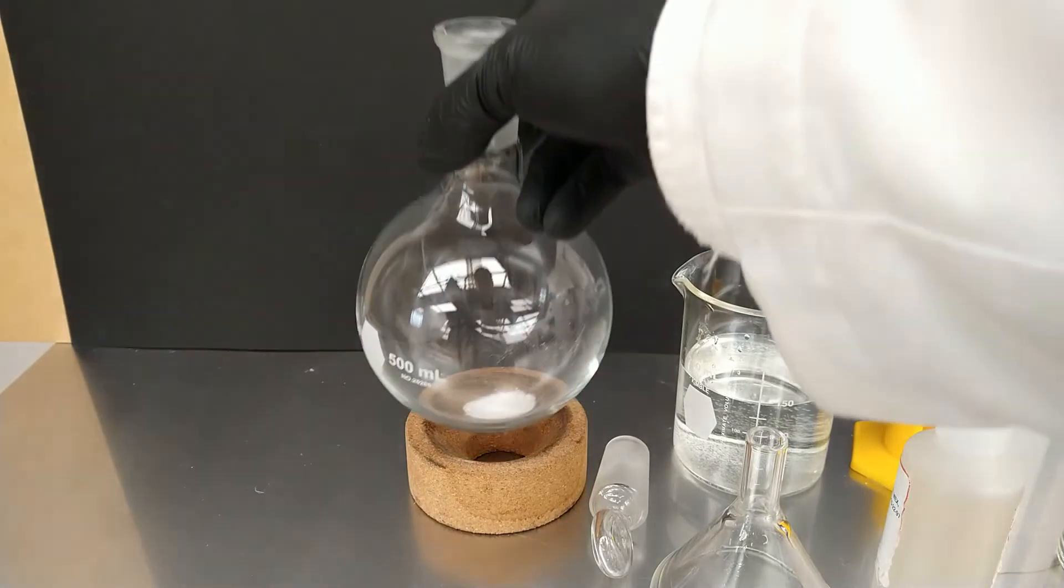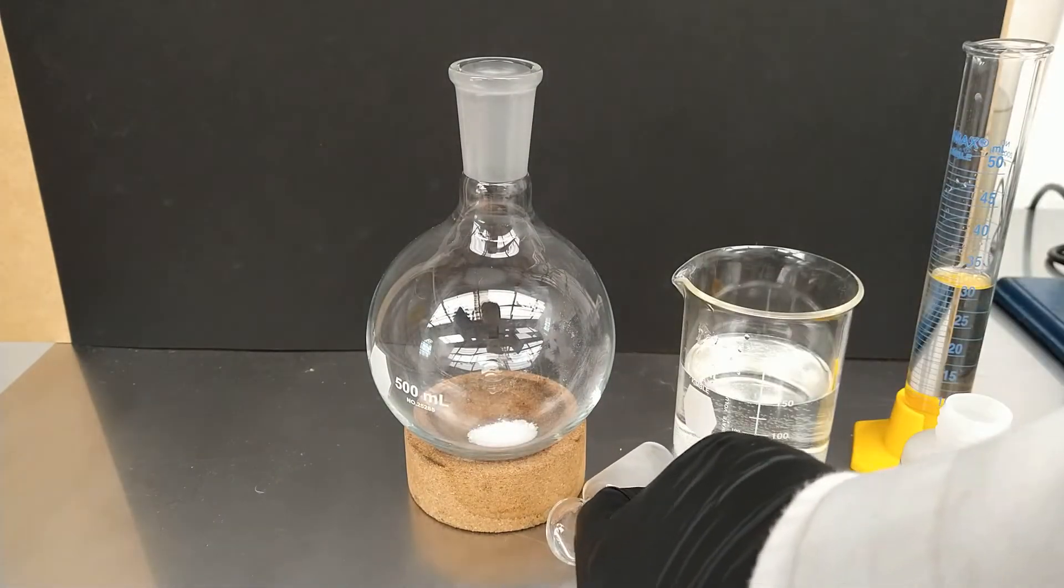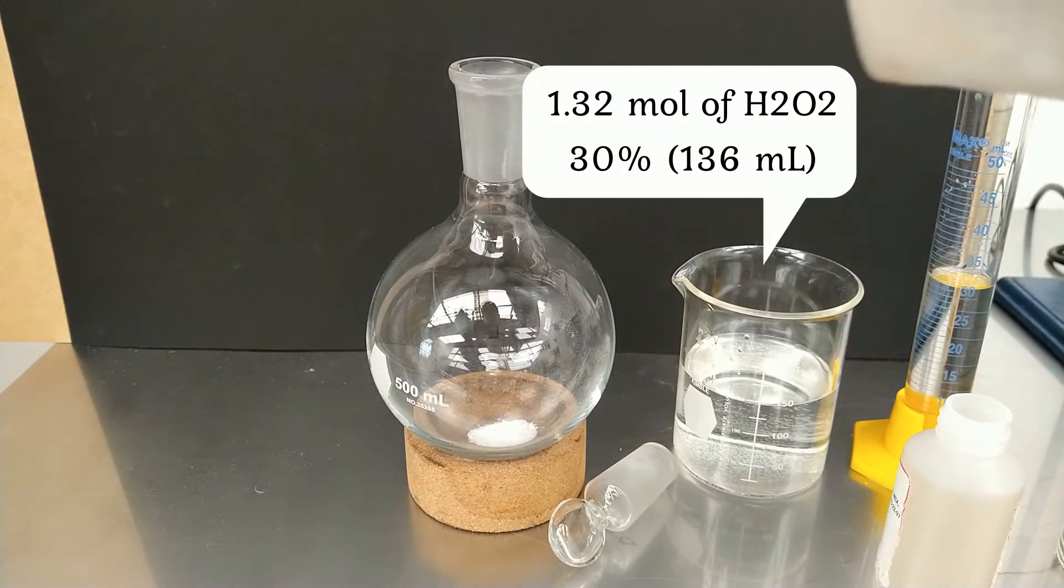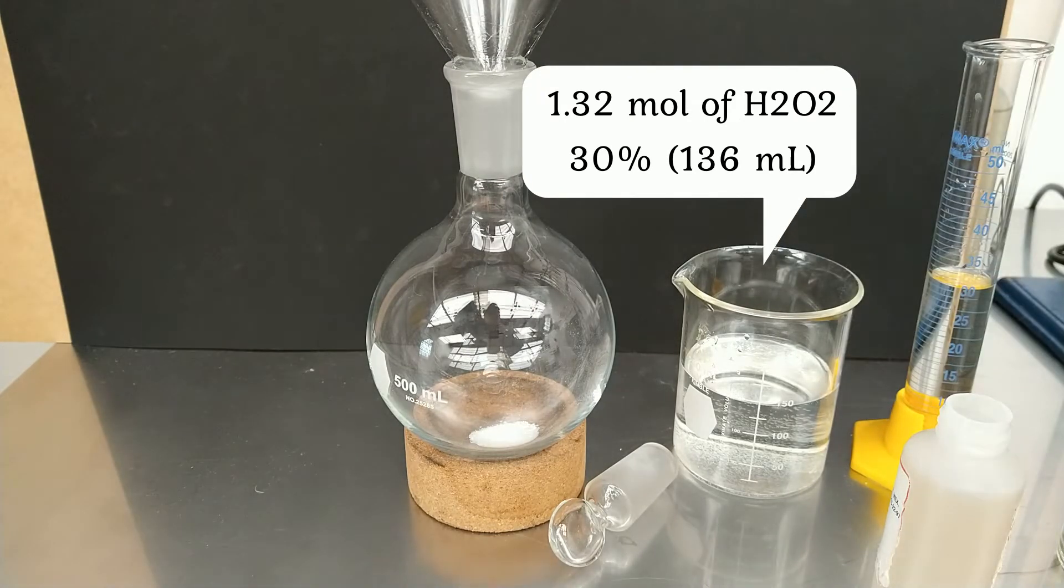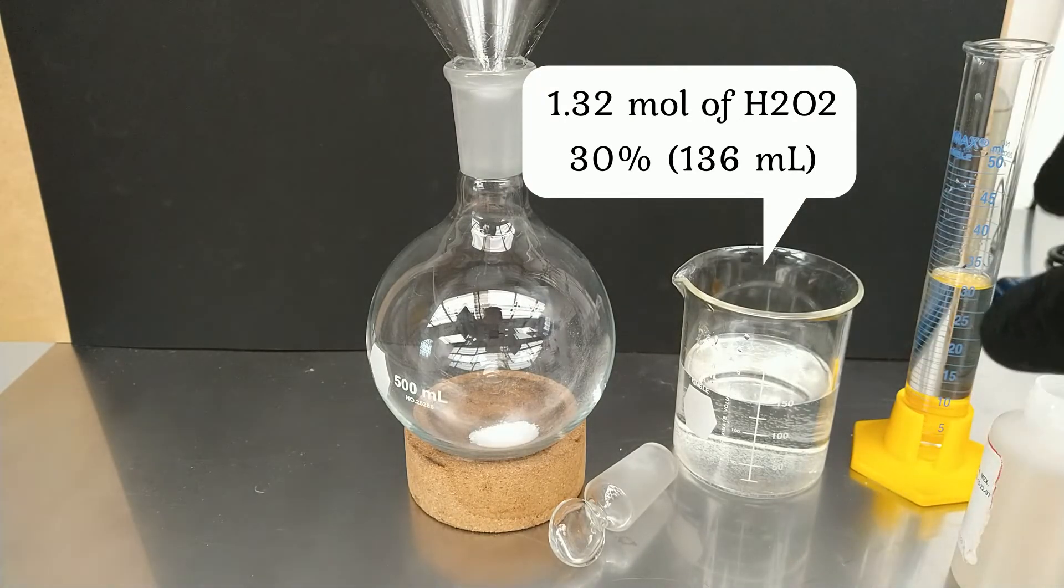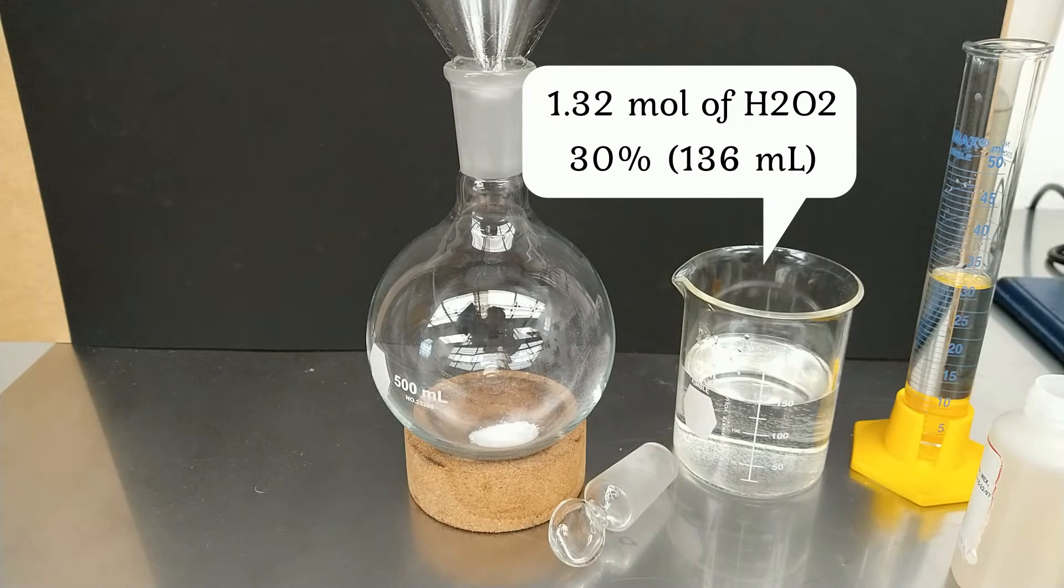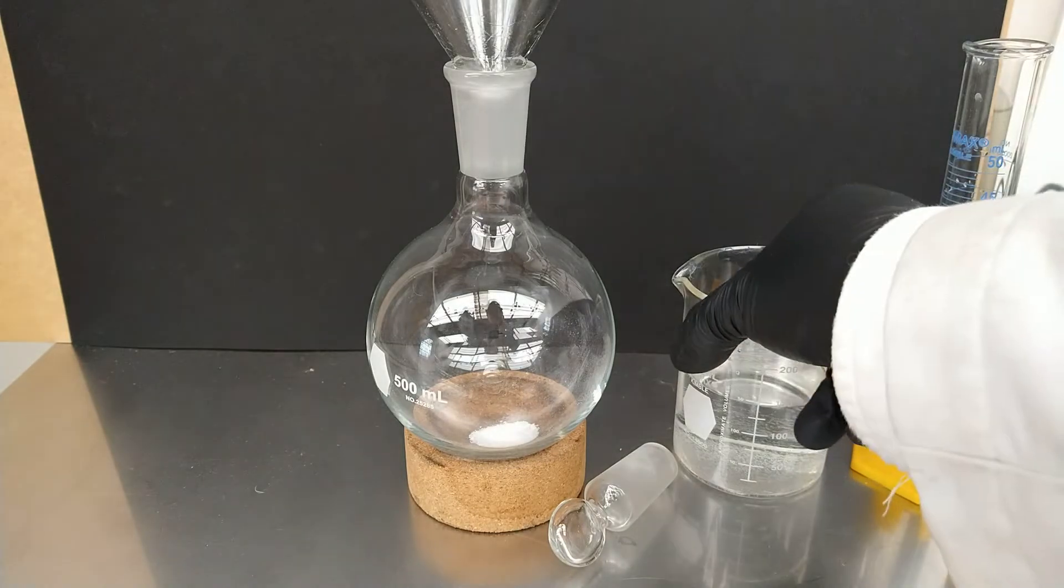To this same flask we are going to add 1.32 mol of hydrogen peroxide, 30%, that is equal to 136 ml of hydrogen peroxide.